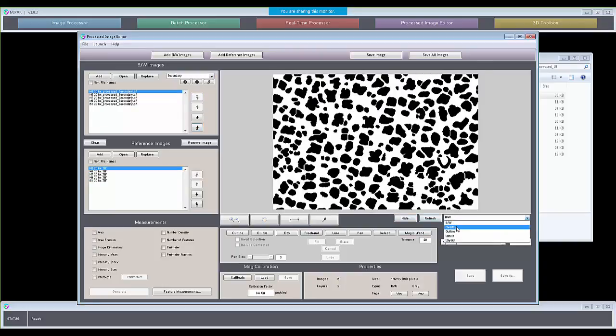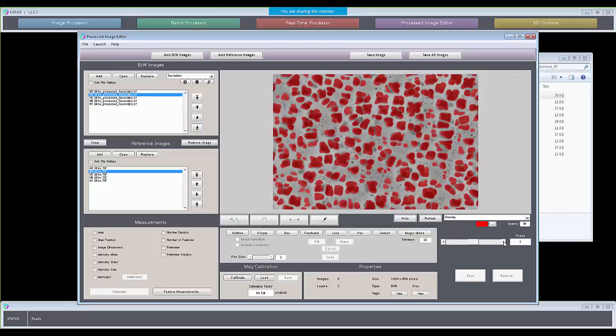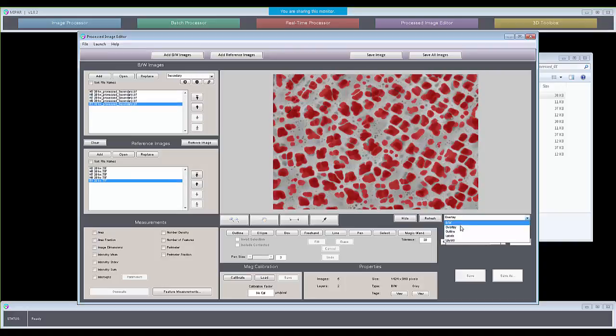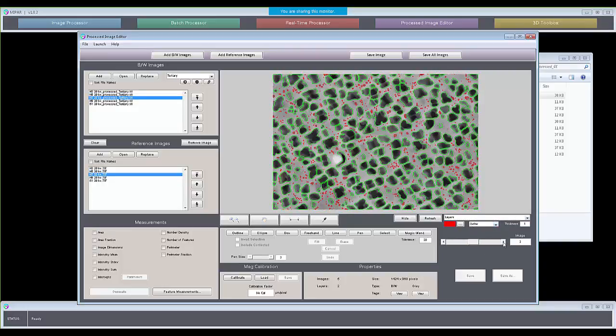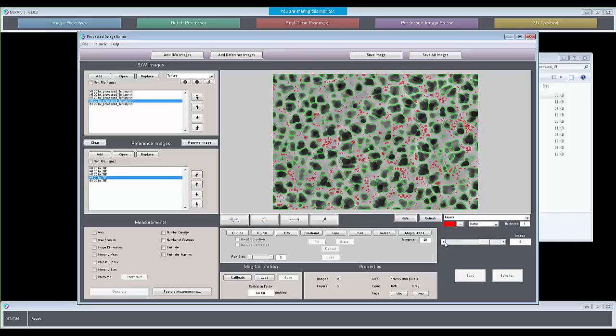But of course, it's nicer to look at overlay. So here we've got the secondary images overlaid for each one. Do outline instead, switch to tertiary, or it's probably even nicer to go in the layers view, outline, and now you can flip through each one and see how your batch did.